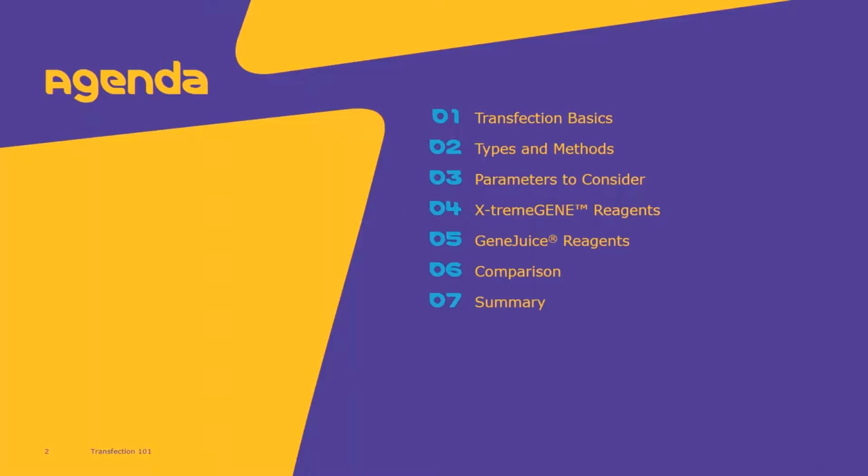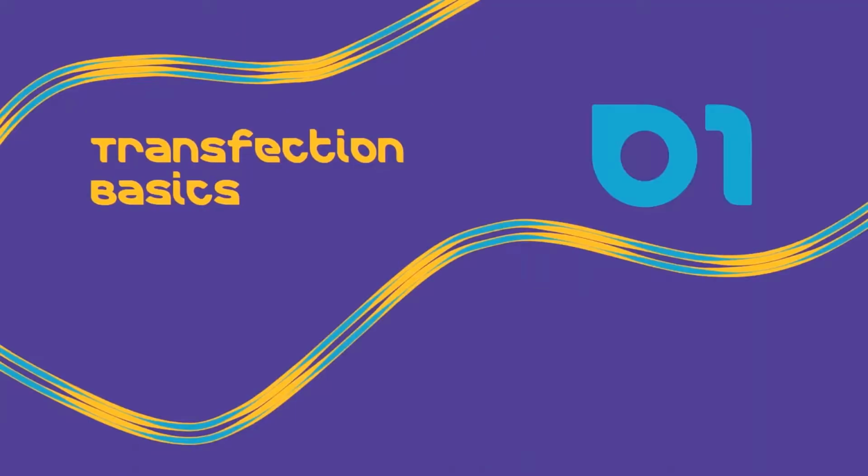During this webinar, I will briefly review the basics of transfection. I will also discuss the various methods of transfection and the parameters to consider during your transfection experiment. Afterwards, I will review the various transfection reagents that are available on sigmaaldrich.com. To kick things off, let's begin with the basics of transfection.